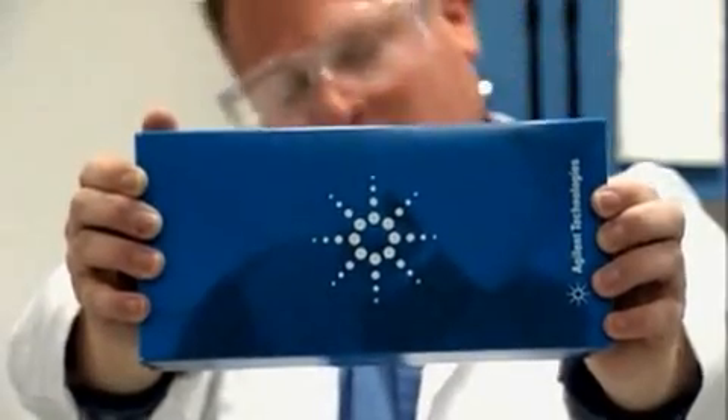His lab mates getting their first good look at the rookie they've heard so much about. Like any good athlete, he stretches it out before the game, but what we're seeing here is that he's really taken the pre-pipetting stretch to a whole new level. Yes, indeed.